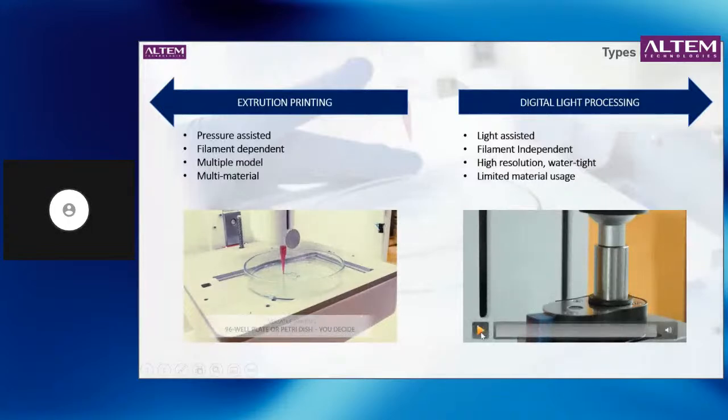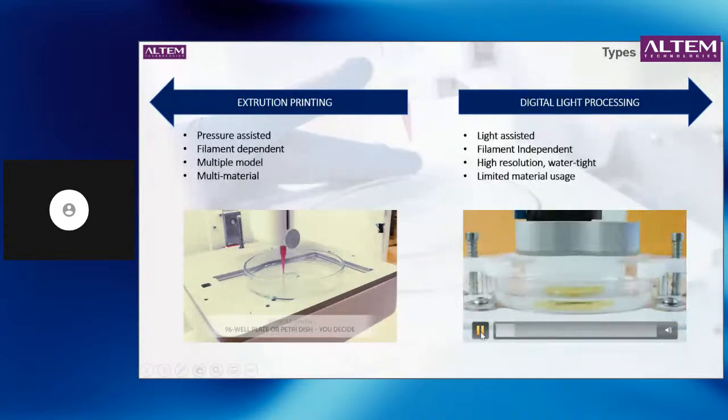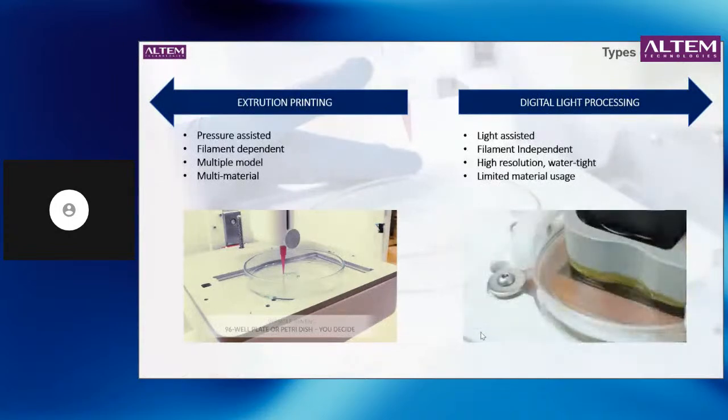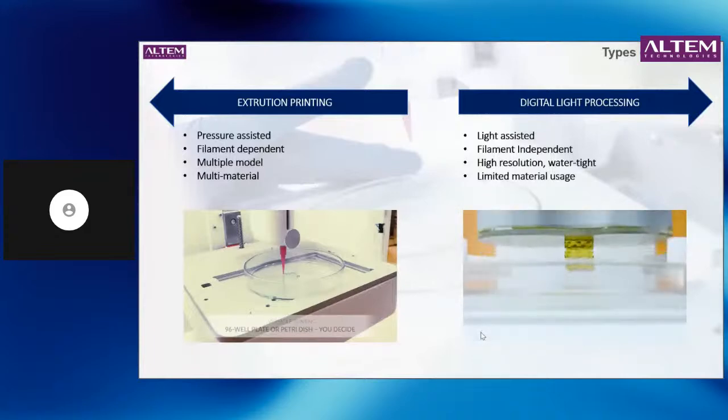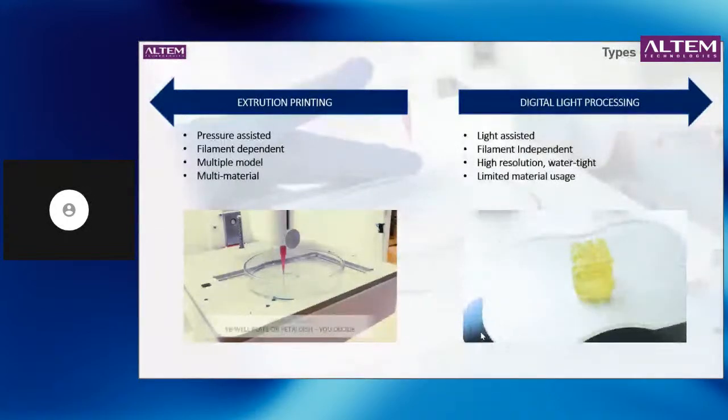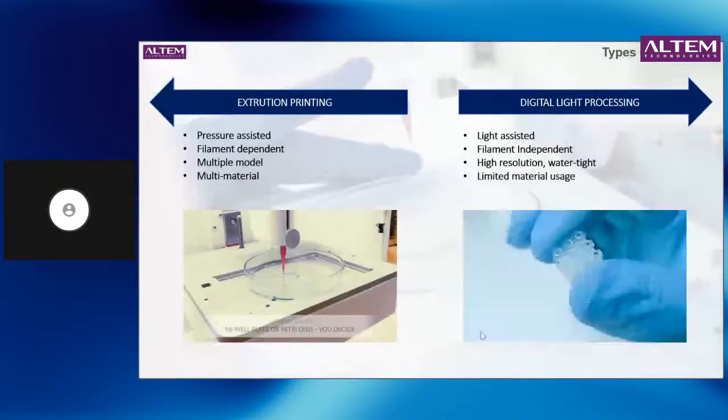Then we have the DLP processing. Now, what you see here are two types of printing processes, and you'll also notice that the way the materials look post processing or pre processing are very different from each other. So, when you're trying to do extrusion based printing, there is a specific protocol of creating hydrogel extrusion paste inks, and there is also a specific protocol for DLP based prints.